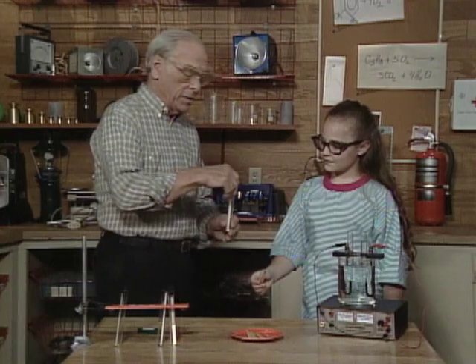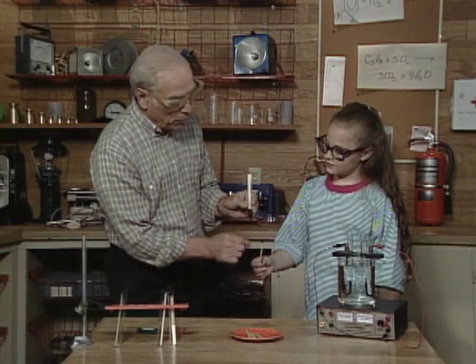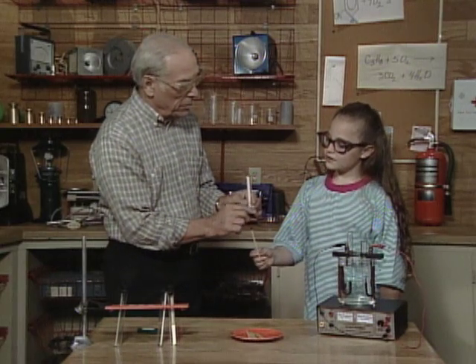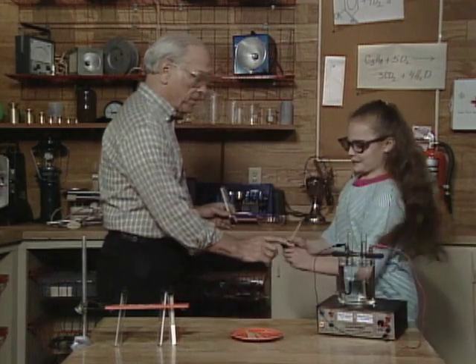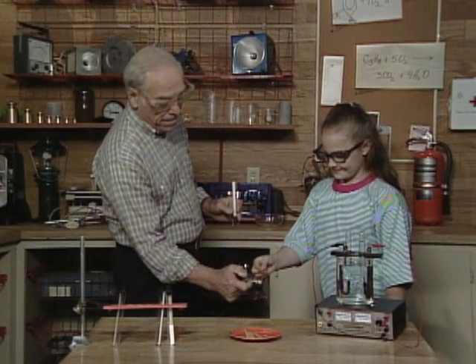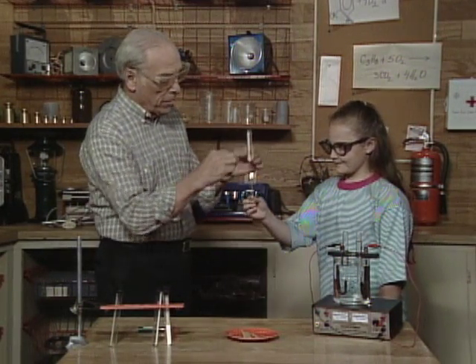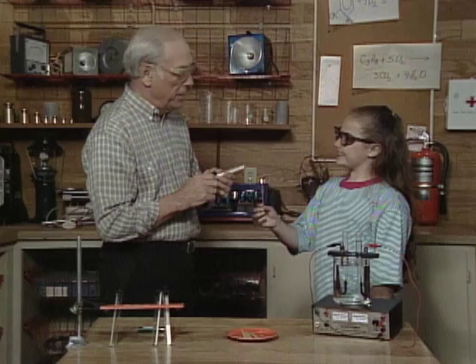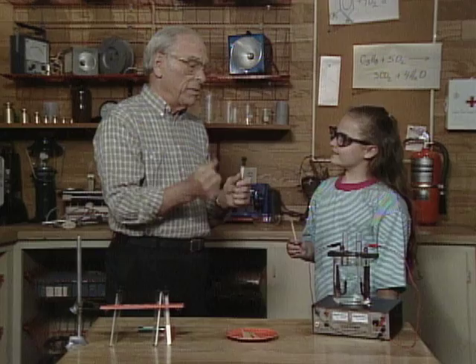Now the test for hydrogen is just the opposite. This time I'll have to turn it upside down because hydrogen is lighter than air. I'll light this again and you bring the flame up near the gas. Are you ready? Yeah — it explodes! The reason it explodes is we're combining the hydrogen with the oxygen in the air.